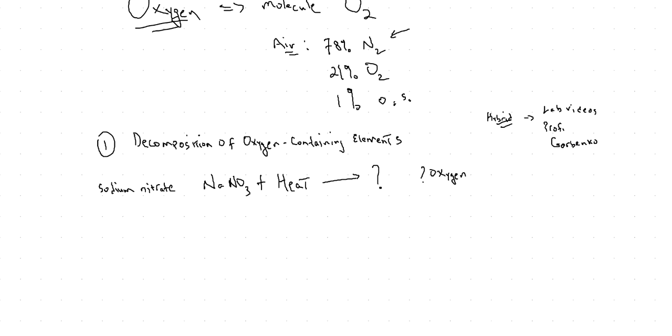The next thing we look at is silicon dioxide. You might remember that silicon dioxide, SiO2, is really just sand. Again, we're going to add heat and we want to see if there's oxygen. We're also going to look at properties. We want to write down if it liquefies, if it changes color, if it gives off a gas, whatever it does, we want to see.